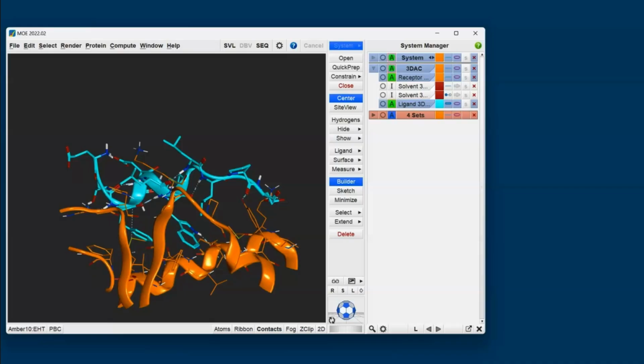So with that we've set the rendering, we've prepared our model, we've rendered it to our liking, and next what we can do is familiarise ourselves with the interaction between peptide and receptor, and based on that analysis we'll see if we can optimise our peptide design.